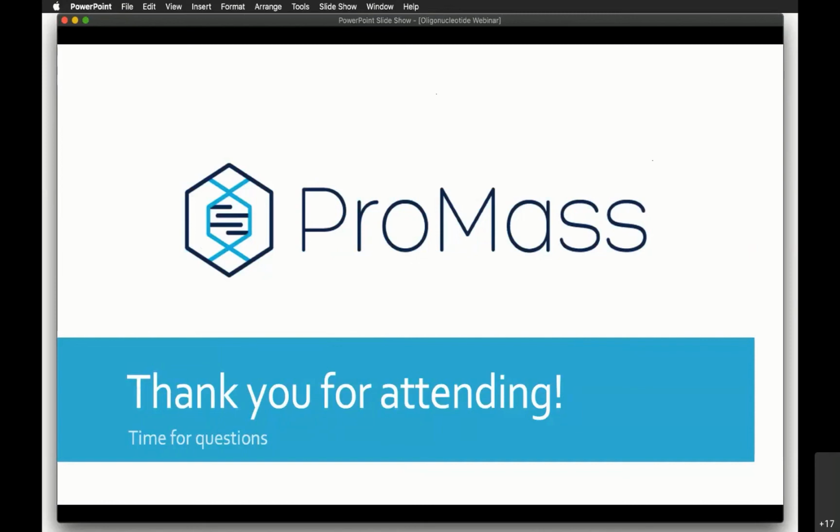As far as reporting the adduct formation, I suppose it could come down to a personal choice. We typically tend not to report the adducts in the calculation for purity because, again, they're not really part of the sample so much as they are just coming from the mass spec process. Okay, thank you. Sure, thank you for your questions.